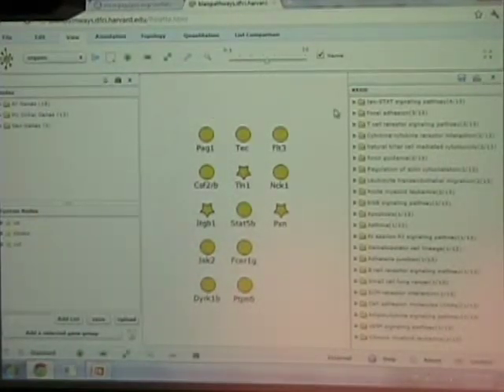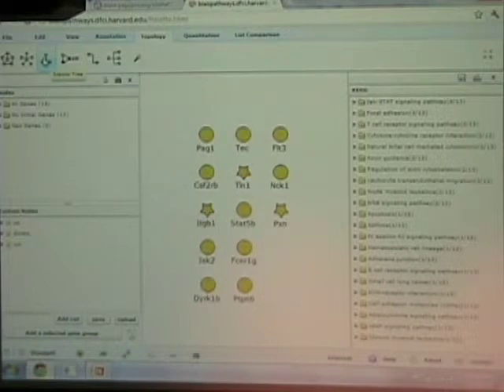And you would like to know, how do I make sense of this as a sort of on-the-fly pathway creation, and also what other proteins are implied by the proteins that I'm seeing here. And so if you go to topology, there's a tool called Steiner Tree, and this could be made arbitrarily complex, and it's an area of research, but I'm just demonstrating, just to give you an example. So what we're going to do here is try and connect these guys up together, and this is our data sources. And you are free to select different data sources and rank them differently.